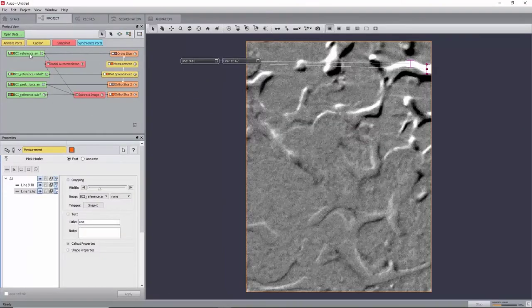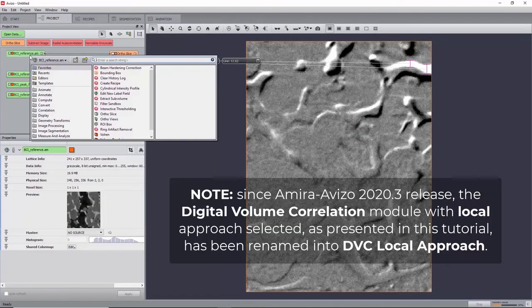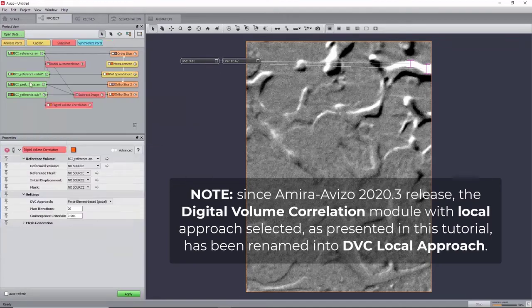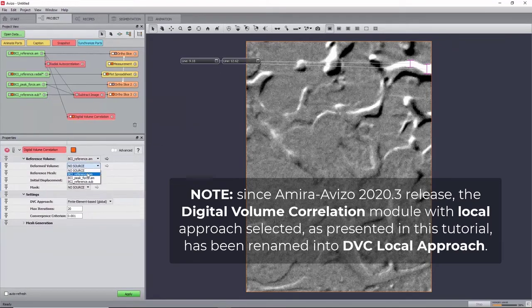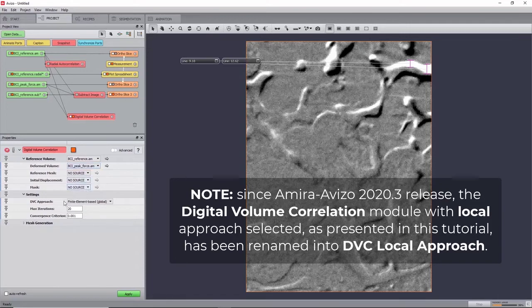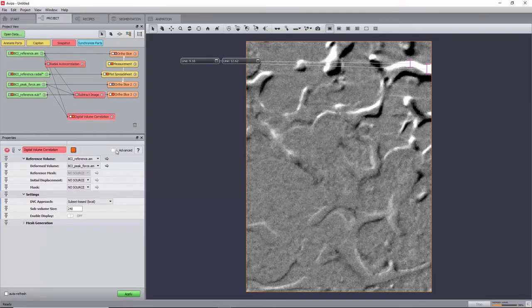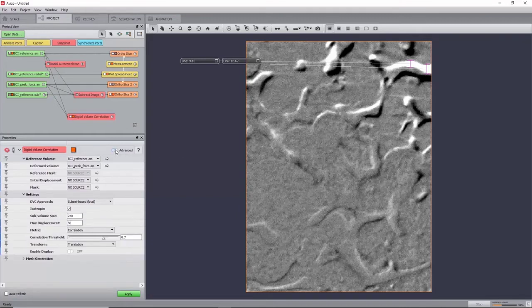You can now attach a digital volume correlation module to the reference image. Set the deformed volume port to the deformed image, and the DVC approach to subset-based local. To have access to more options for fine-tuning the algorithm, activate the advanced toggle switch.